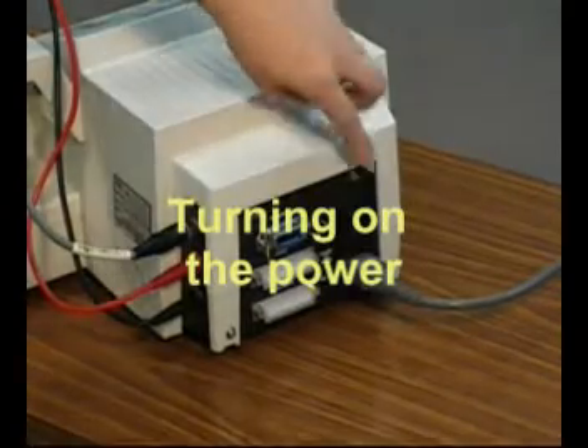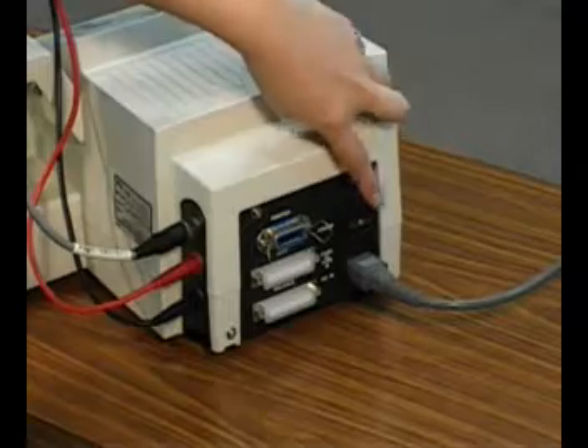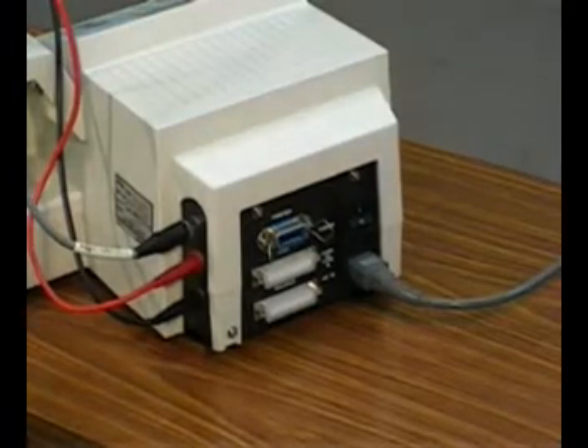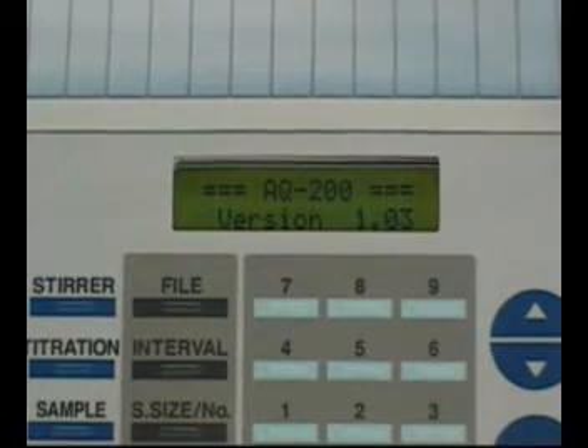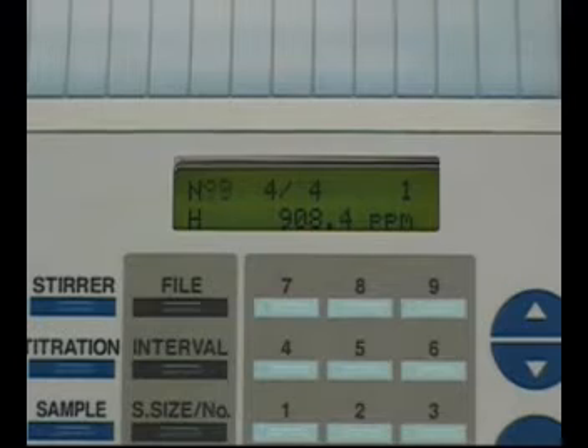The power switch is located on the back panel. After the power is turned on, the LCD screen shows the start-up screen, then turns to the current status screen. At the same time, blanking will automatically start. Please wait until the background level becomes stable and an S mark starts blinking. It will take about 15 to 30 minutes after power is turned on.